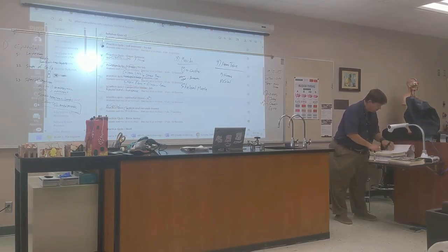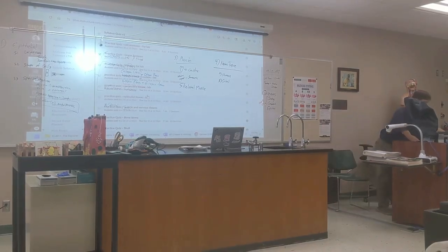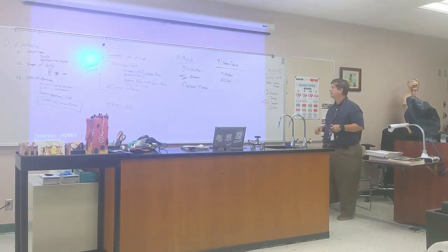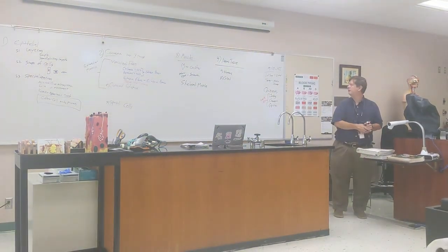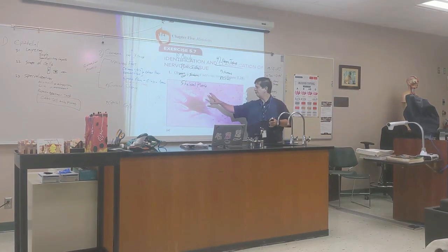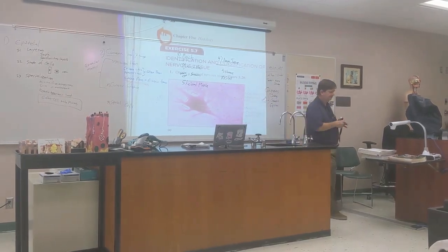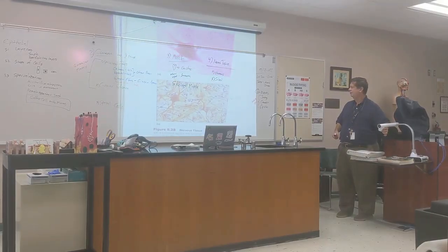All right, so the lab book exists. The lab book has pictures of neurons, and I'm going to flip back to it. They have this drawing of a neuron, the classic drawing that's in all the textbooks. I mean, that's a photograph of one that really does look that way. And here they show them with all the glial cells around them.